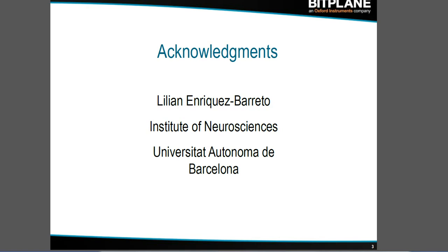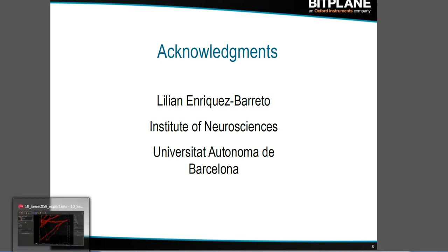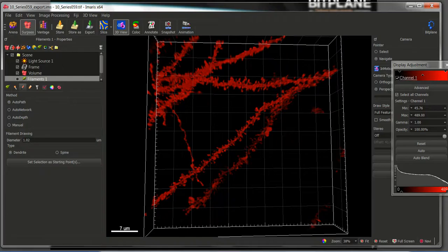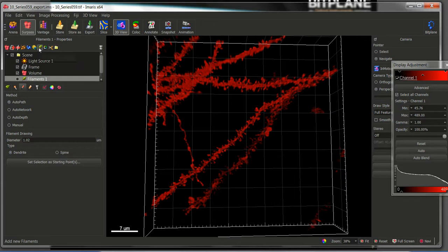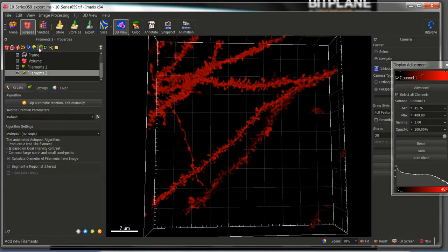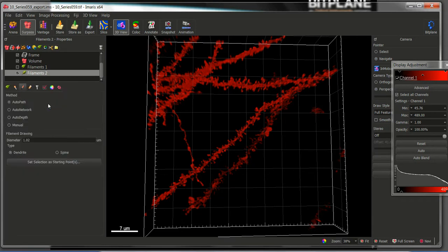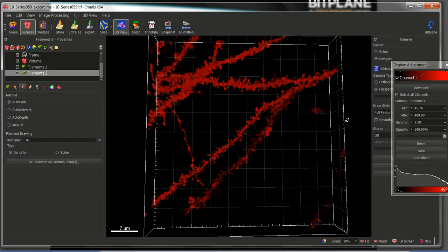So let's start opening Lilian's image in Imaris. First of all what we need to do is to add a new filament. We will skip the automatic creation and in this case select the AutoPath algorithm method in order to draw the dendrites of interest.